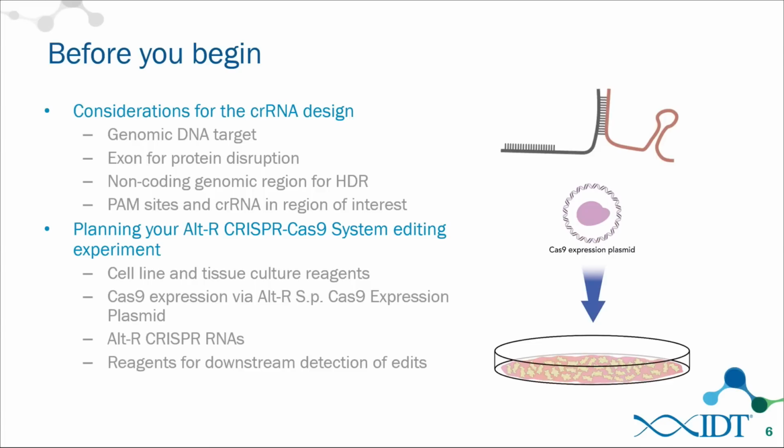And what other reagents might be necessary as you go into this for downstream detection of edits, whether it's specifically looking for editing by sequencing, by the T7 assay, or is it a phenotype readout that's going to be looked at.